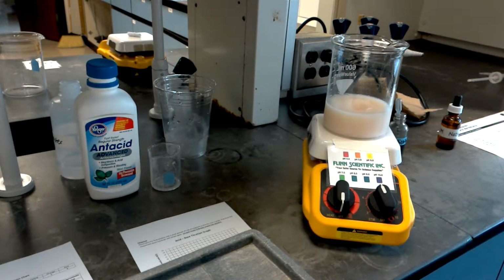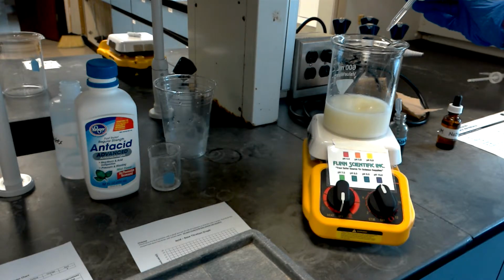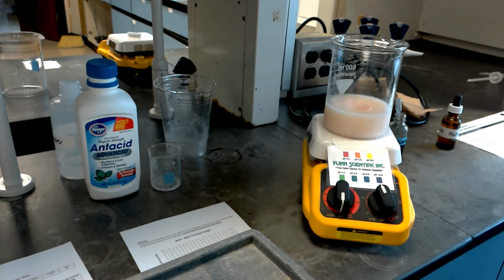32 drops. We're moving from the yellow closer to the orange. Again, we're neutralizing all those hydroxide ions. They're all neutralized at this point, so we're just adding more hydrogen ions or hydronium ions. I believe we're at 34 drops.